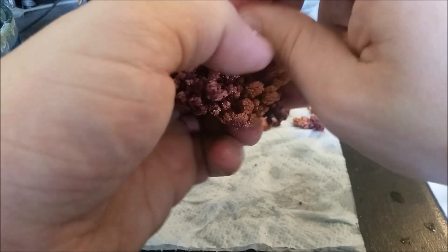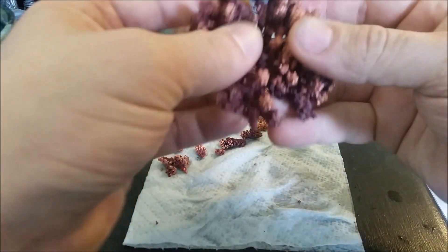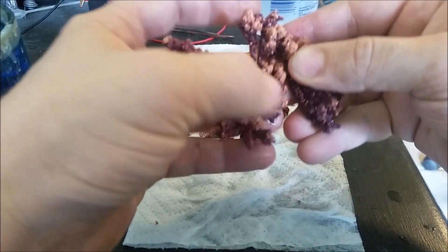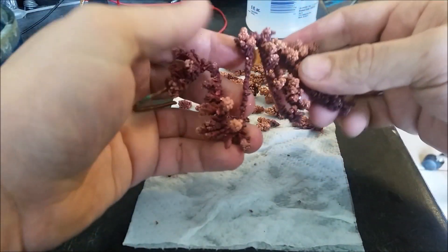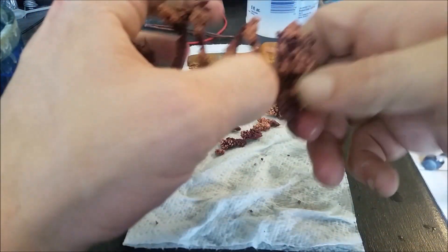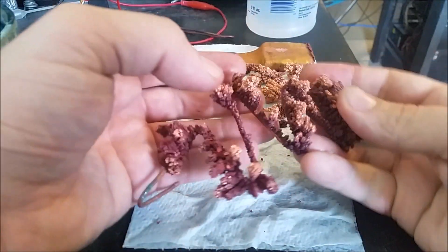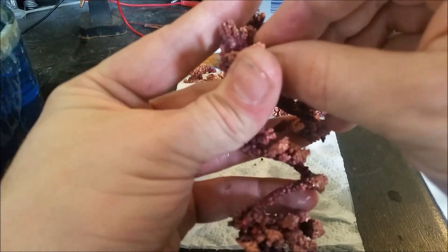I don't know how many more good ones I'm going to get off this one. Since I don't plan on reusing this cathode, I may as well stretch it out to make it easier.